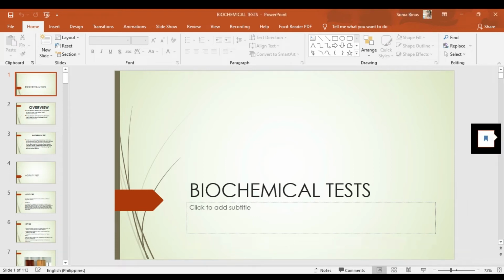Hello po. Today I will discuss about our biochemical tests. So biochemical test is used for presumptive identification of our organism.